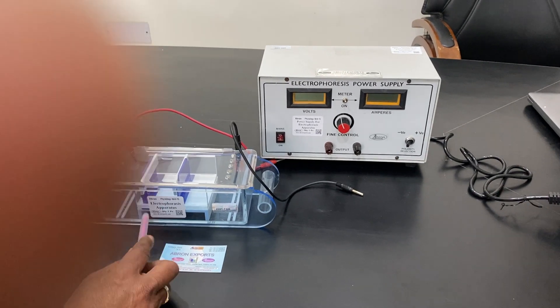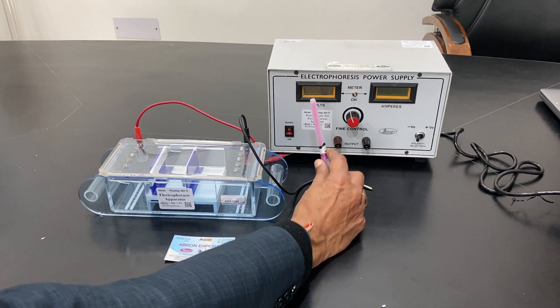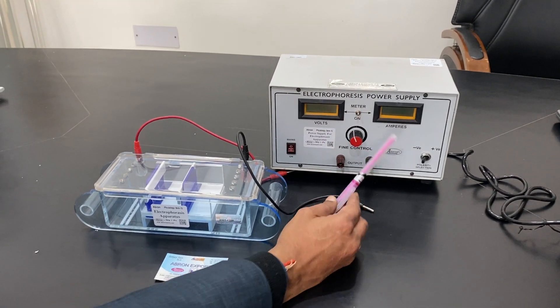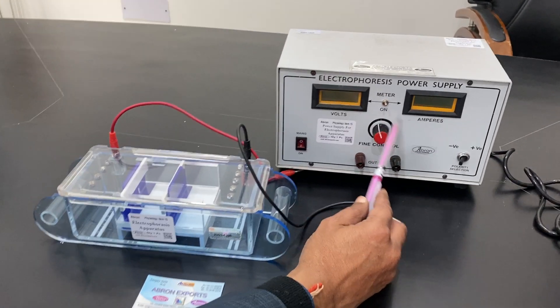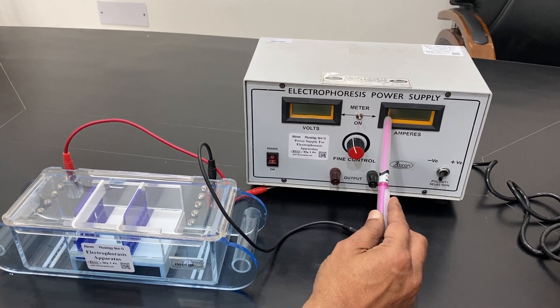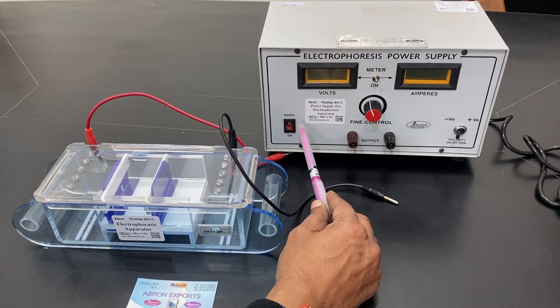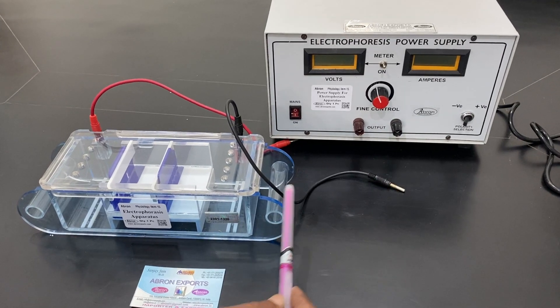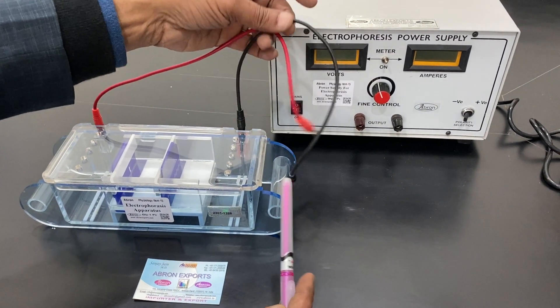This is an electrophoresis apparatus, and this is a digital power supply with an LCD display and LED indicator. It features a fine control of 300 volts plus or minus, and a 1 ampere power supply with an on/off switch and variable control output that you can connect to the unit.